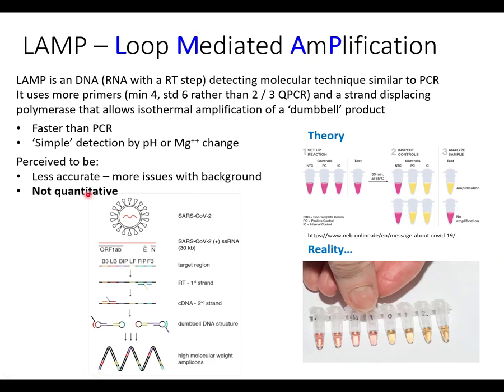And it's perceived also as being not quantitative. This is from the NEB website, New England Biolabs. They're one of the biggest manufacturers of LAMP technology kits. And this shows you their slide about using LAMP for detection of COVID.